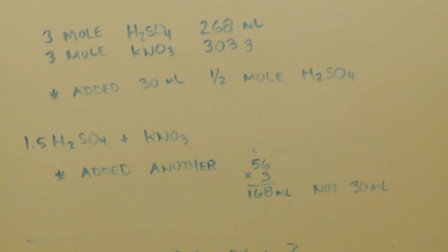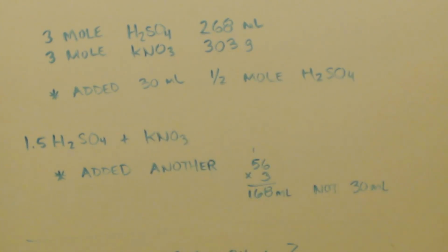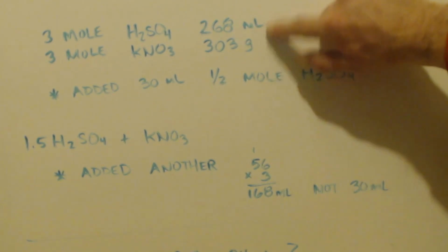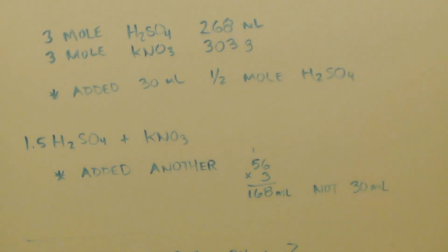In the middle of the distillation, I was like, wait, I want to see what happens if I add even more sulfuric acid in. So I stopped the distillation. I added 30 more milliliters, a half a mole, not realizing I never figured it out. I was still doing a 1-to-1 ratio. So anyways, halfway in, I threw in 30 milliliters.